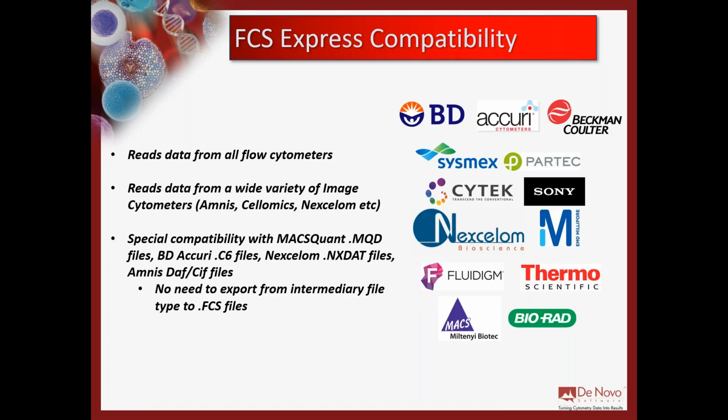And what we do in FCS Express, because of the partnerships that we've had with these companies, is we can read those files directly. And that way we don't have to work with some sort of intermediary file to get that to an FCS file to bring into the software, which just adds an extra step of complexity when you get into compliance. So do keep that in mind.